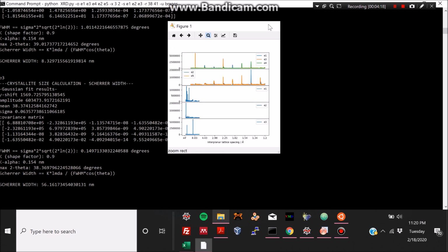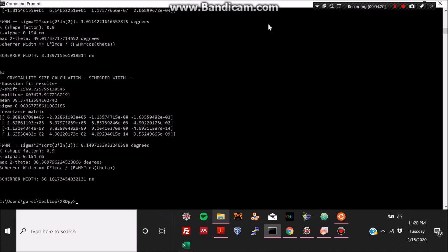Please make sure to remember to start it. Actually, that's not all I have, right? For some reason, it's continuing.